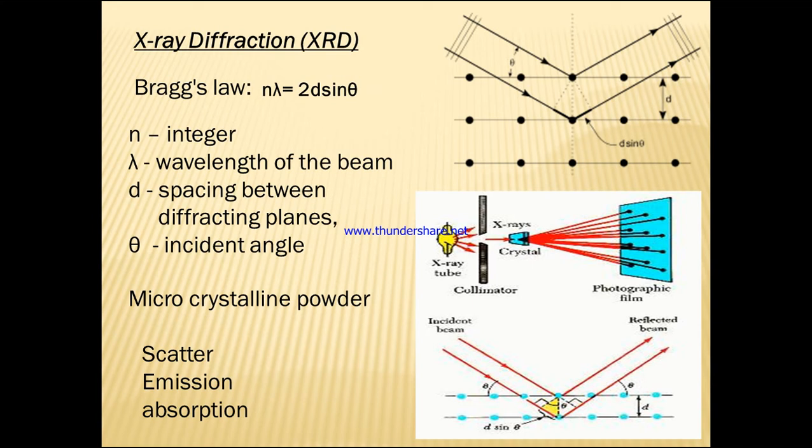So we are having the X-ray tube. In the X-ray tube we are going to have a metal target as well as high velocity electrons, whose bombardment takes place in this X-ray tube to give us the production of the X-rays here. So we are having the collimator. The collimator is a set of closed metal plates that are separated by a gap, which is used to produce narrow beams.